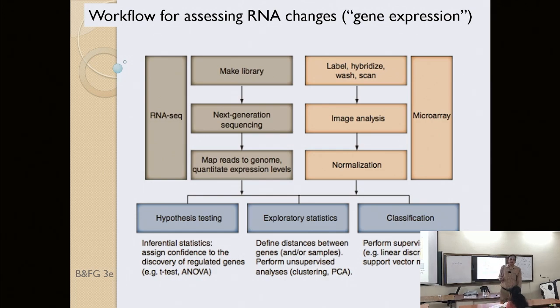And then the RNA library is subjected to sequencing, next generation sequencing. So this can sequence multiple RNA reads, and these reads are short fragments from RNA transcripts. It can sequence millions to billions of these short sequences arising from RNA transcripts.